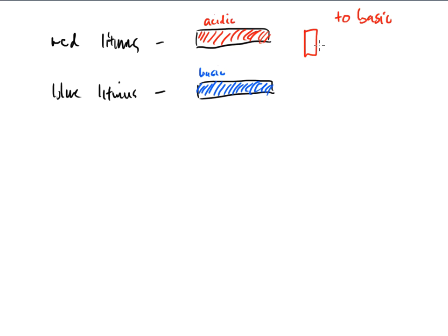So what happens here is that I'll take a container, I'll dip a stirring rod down in it. I'll take a drop of that solution and I will put it onto the acidic paper. And if that paper turns a blue blob, blue means base, then ding ding, I've got a basic solution on my hand. That is how we use these papers in the laboratory, right?